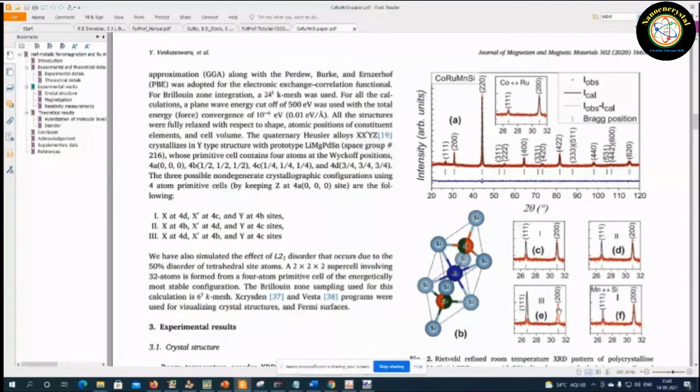Please proceed. So you can actually go through this paper. Only look at how the refinement is done, and we practice. And if you have doubts, please let me know.